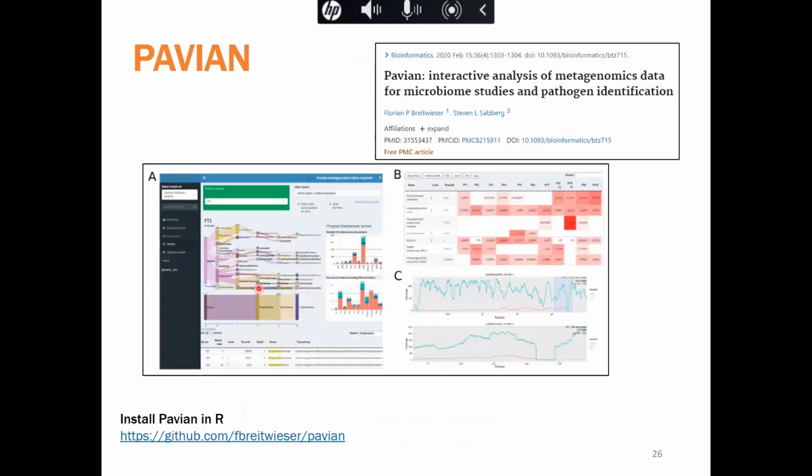So once you're done performing taxonomic classification, you can visualize the Kraken 2 reports, or really any report from the Kraken software using the Pavian Shiny app. Basically this particular program compiles all of the read counts per species and allows between sample visualization and comparison. Now, this tool wasn't necessarily developed for single isolate data. It's actually a tool that's primarily used for metagenomic data sets, but you still can visualize the data for single isolates. And it's kind of a nice way to easily take a look at your data as opposed to looking at lines and lines in a spreadsheet.